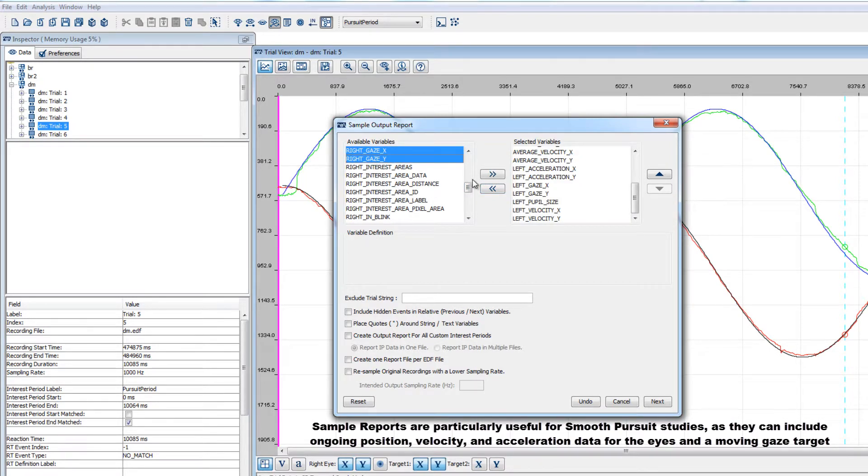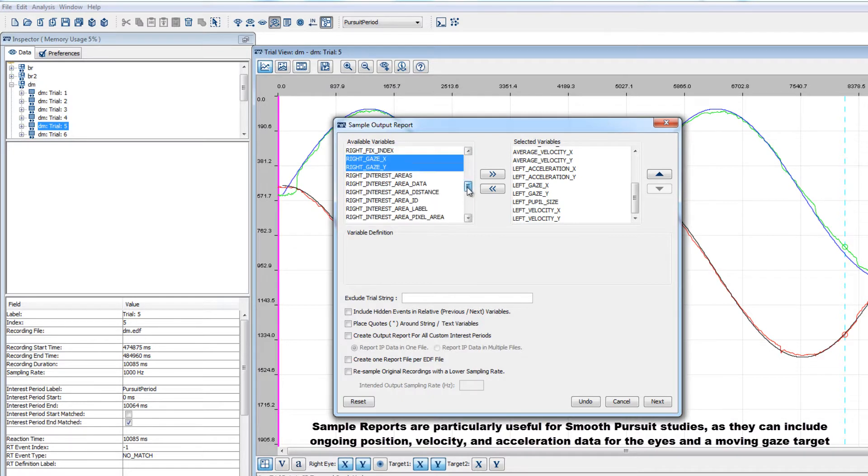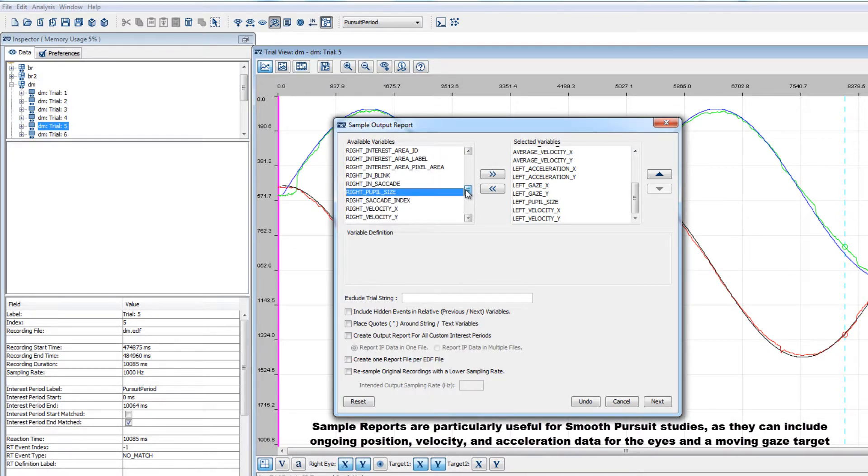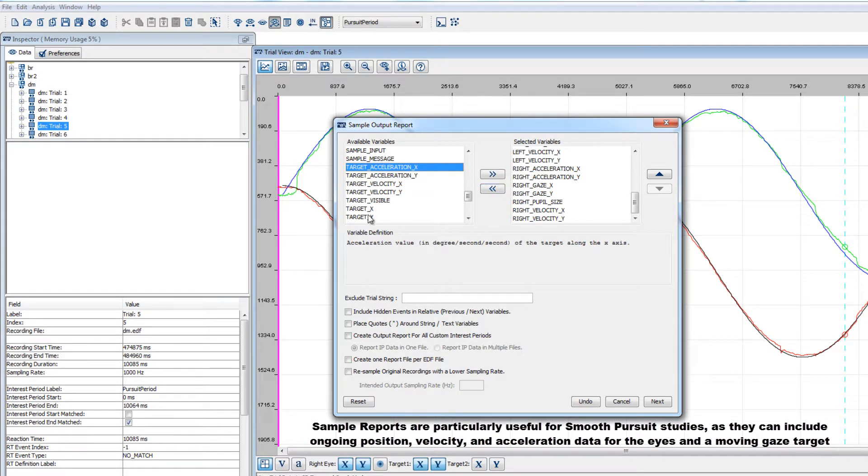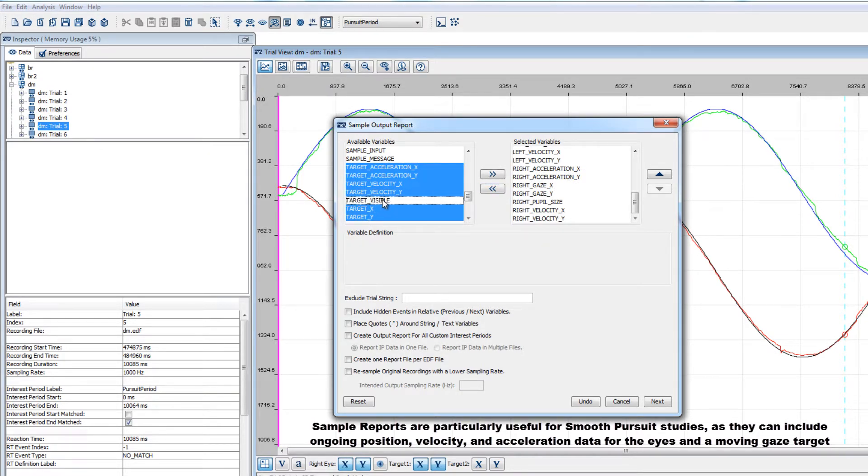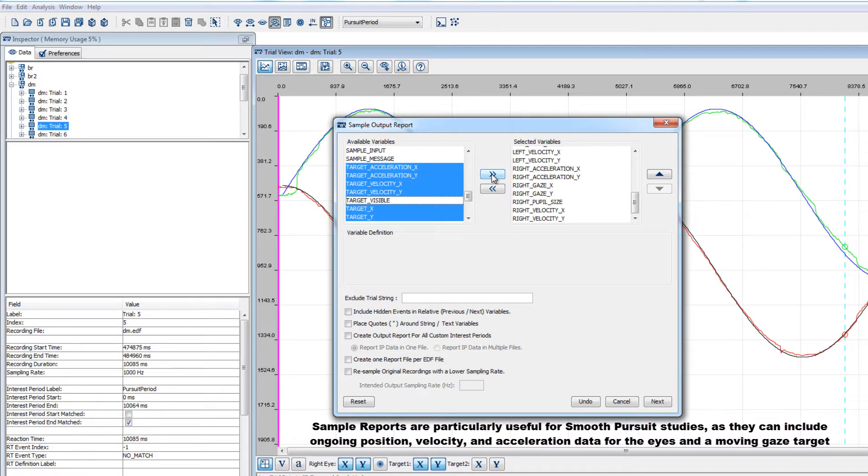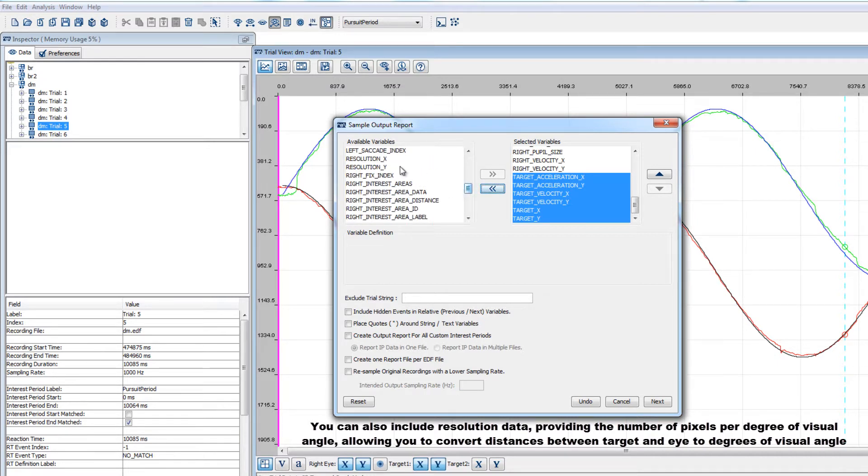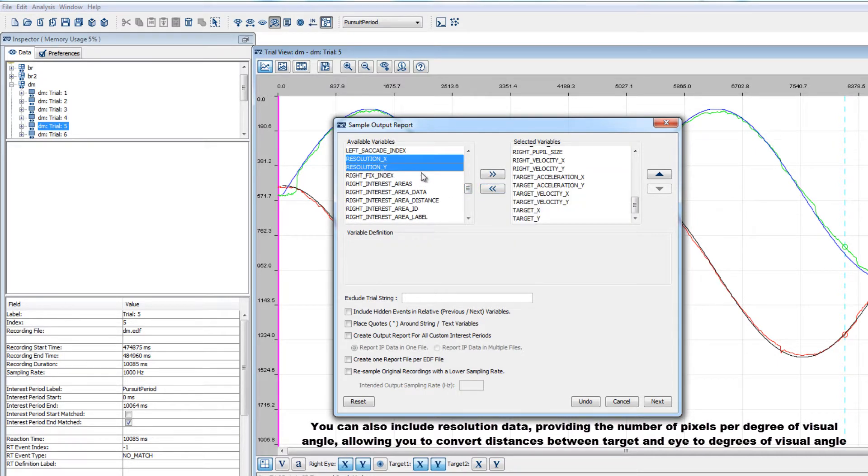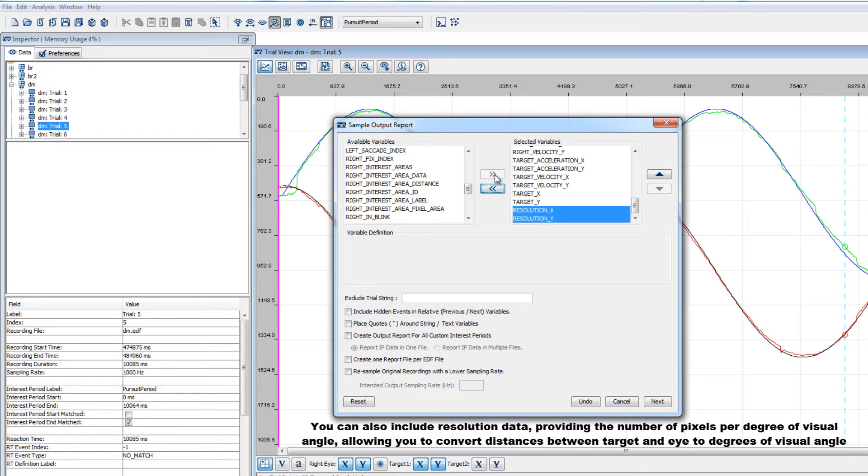The sample report also allows you to include velocity, acceleration, and pupil size information about the eye over time as well. If your experiment sent target position messages to the EDF file to keep a record of the position of a moving target over time, then you can include information about the position, velocity, and acceleration of the target as well. And you can include resolution data, which gives you the number of pixels per degree of visual angle in the horizontal and vertical dimensions. This information will allow you to do things like convert the distance between the target and eye from screen pixel units to degrees of visual angle.